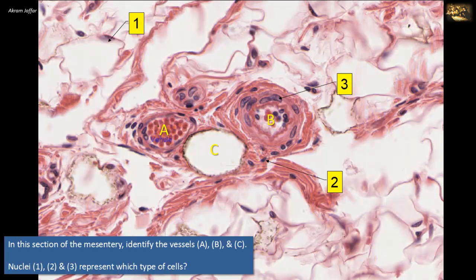A is a venule. It's a muscular venule, to be specific, with 2 to 3 layers of smooth muscle cells. Smaller venules, which are called postcapillary venules, don't have the smooth muscle coat. This venule, muscular, small muscular venule, has a similar structure to the nearby arteriole, B. But the lumen of the venule is larger and the wall is thinner, as you can see clearly here.